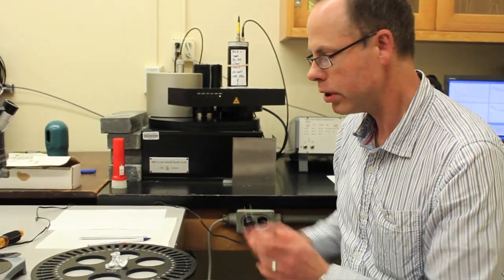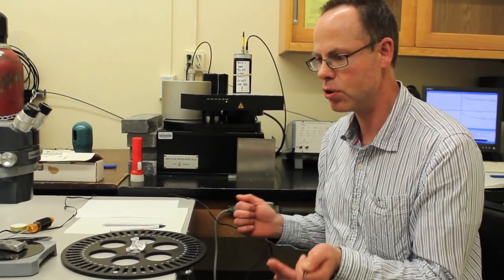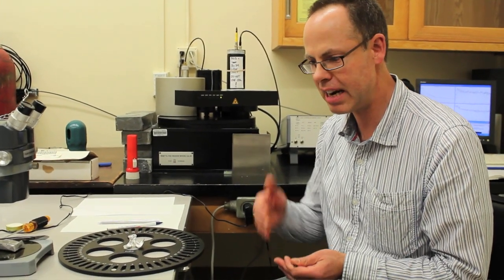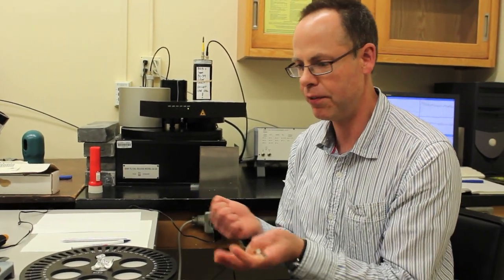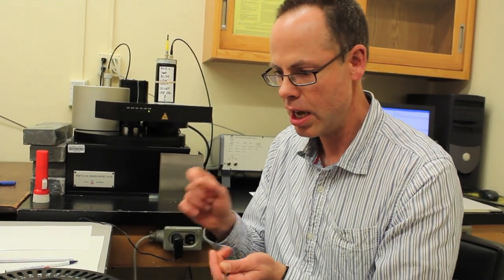So the whole procedure in the machine is a little bit complicated, and that's all controlled by the computer, moves around, and it gives us a series of measurements out. We take those into a different laboratory and we analyze them on a computer. We combine the different signals from different portions of the sample that we measure, and we look at this different response for different measurements made at different times.